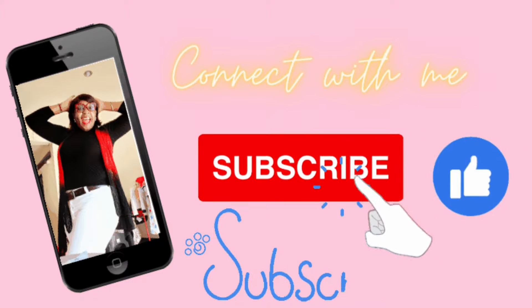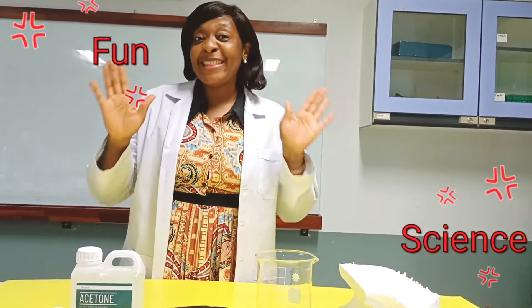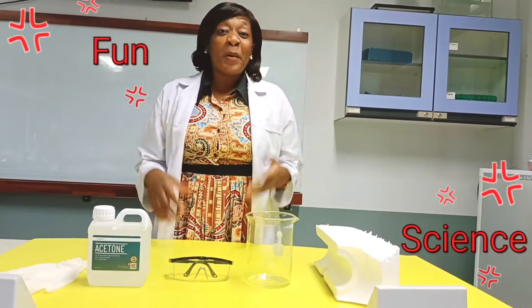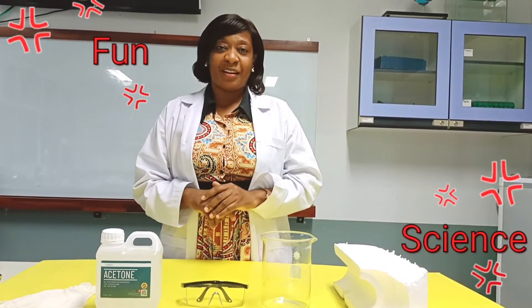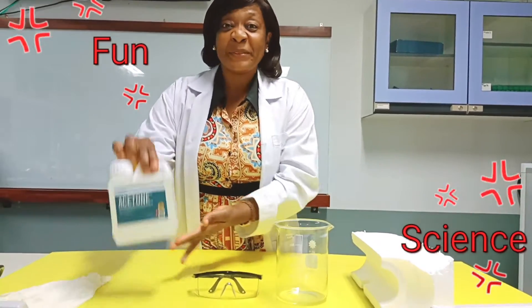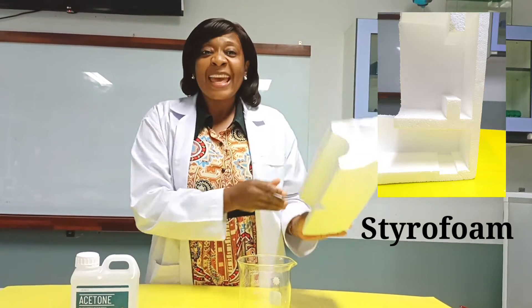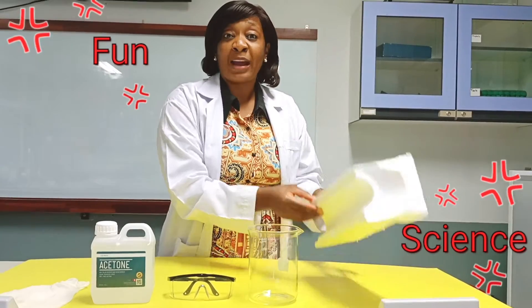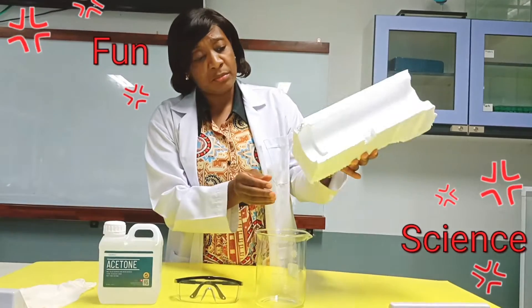Welcome back to another fun science experiment with Mom Jay. In today's science video we are going to be using just two materials: acetone and styrofoam. Guess what we will be doing with these two materials? We will try to fit this styrofoam into the beaker.